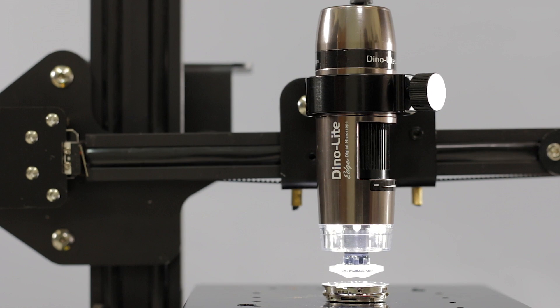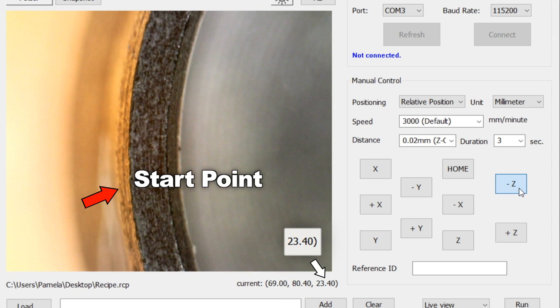This is a simple-to-use solution for the challenge of depth measurement with the aid of a microscope.